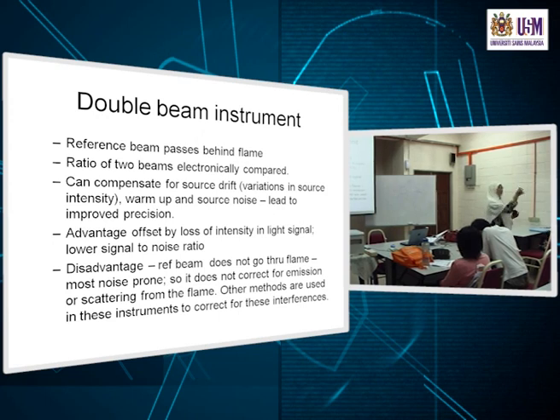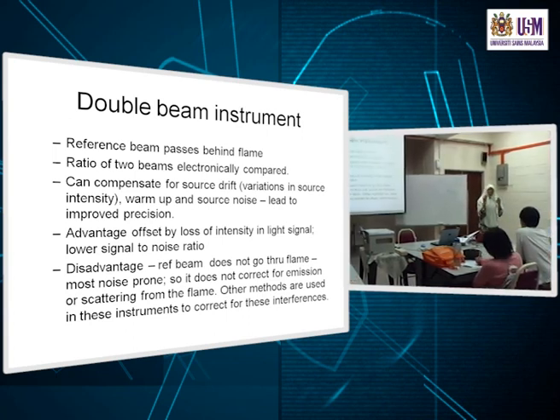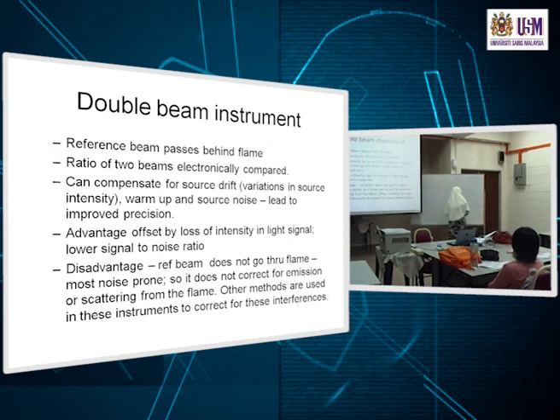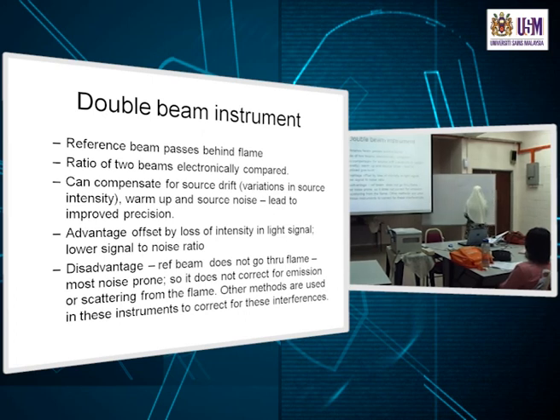So the light from the source is not stable, it is drifting. The intensity is not constant, and after some time the source also drifts. To compensate for this drift, the light from the source is ratioed. It's a good thing because you understand the sample analysis.